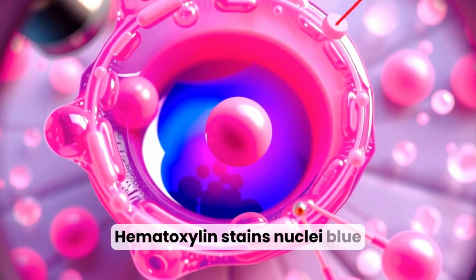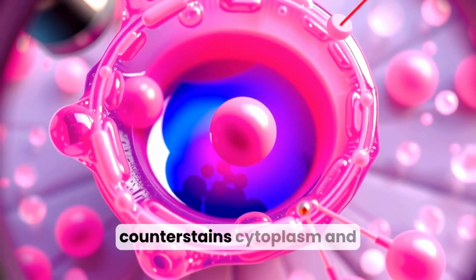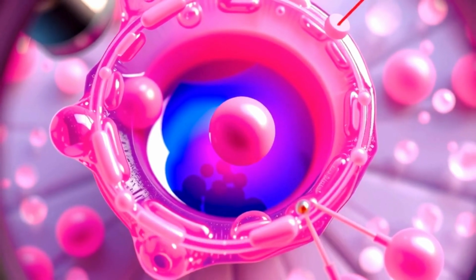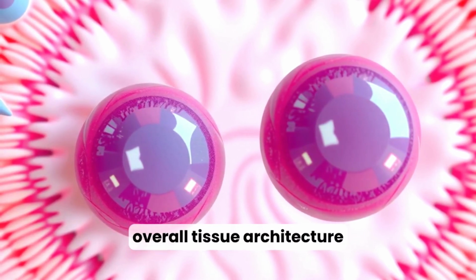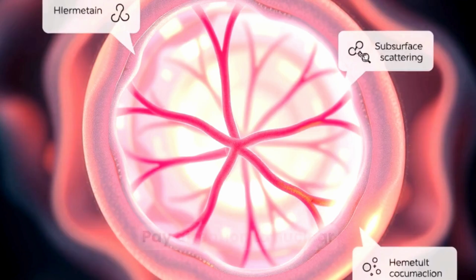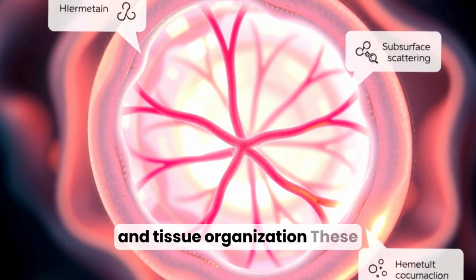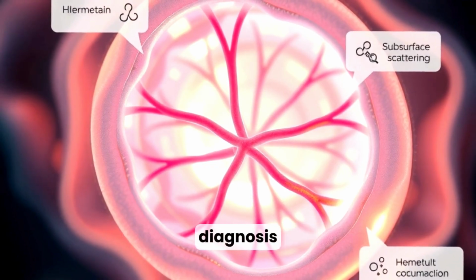Hematoxylin stains nuclei blue or purple by binding DNA. Eosin counterstains cytoplasm and extracellular matrix in shades of pink. H&E provides excellent overall tissue architecture, nuclear detail, and general pathology screening, making it the most commonly used stain. Pay attention to nuclear chromatin pattern, cell size, and tissue organization. These features guide whether special stains are needed for further diagnosis.